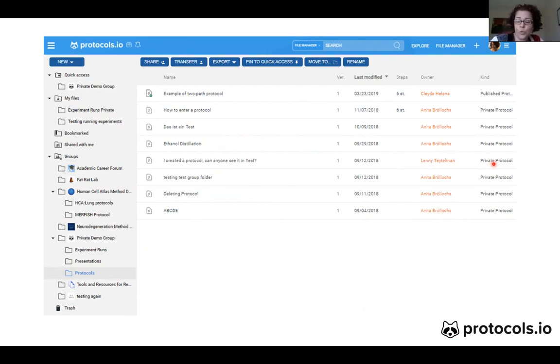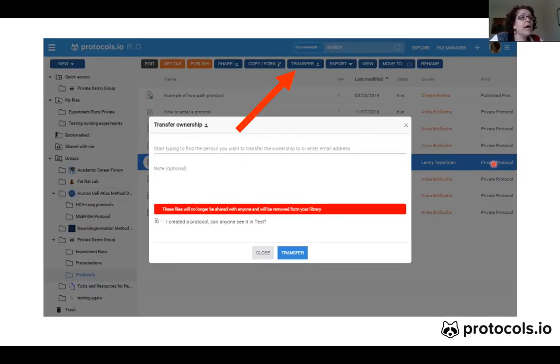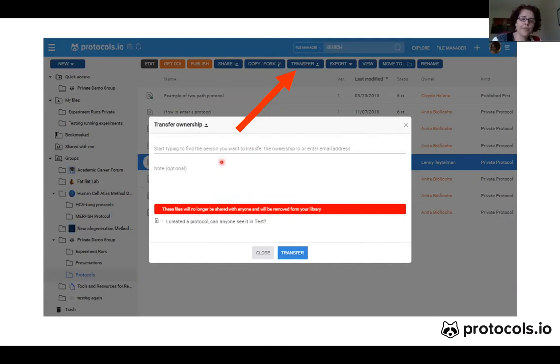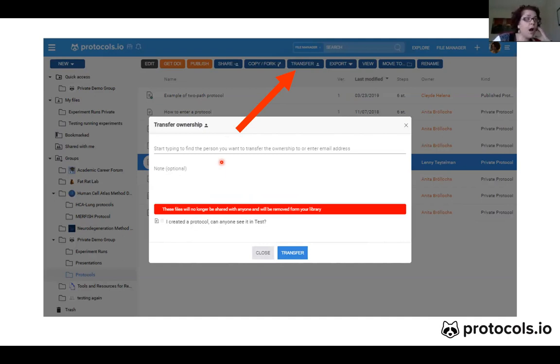As an admin, what I can do is click on Lenny's protocol and then click Transfer. I can then transfer the ownership of this protocol to someone else by writing the email of the other group member I want to be the owner of that protocol, and then click Transfer — and it's done.